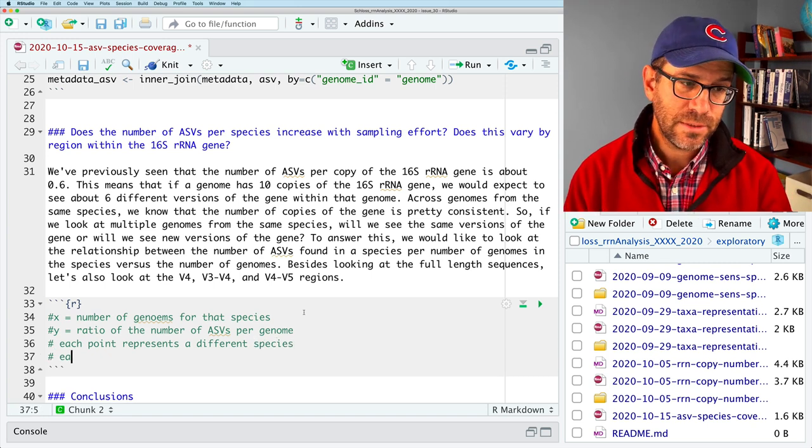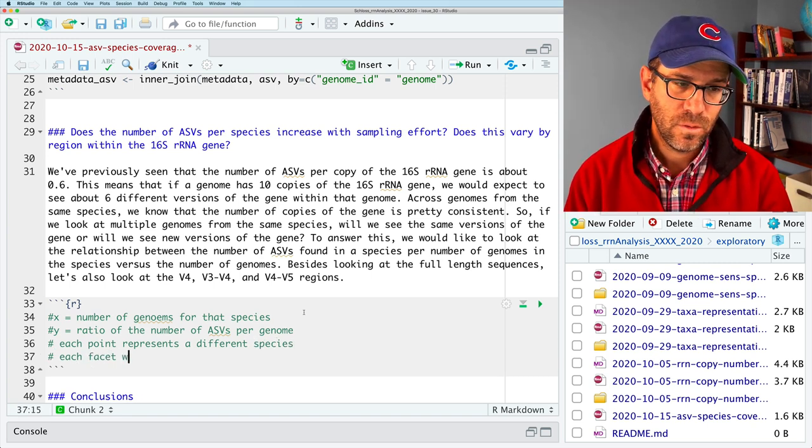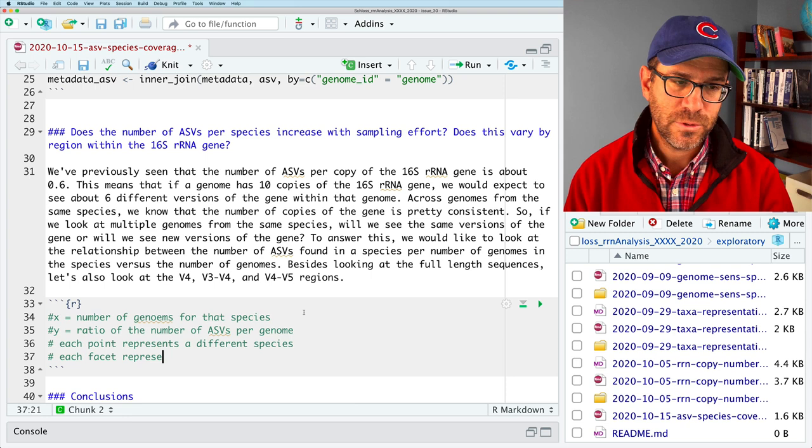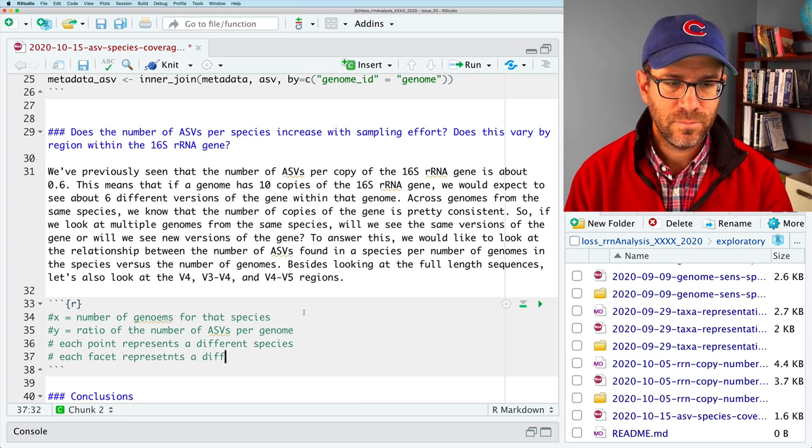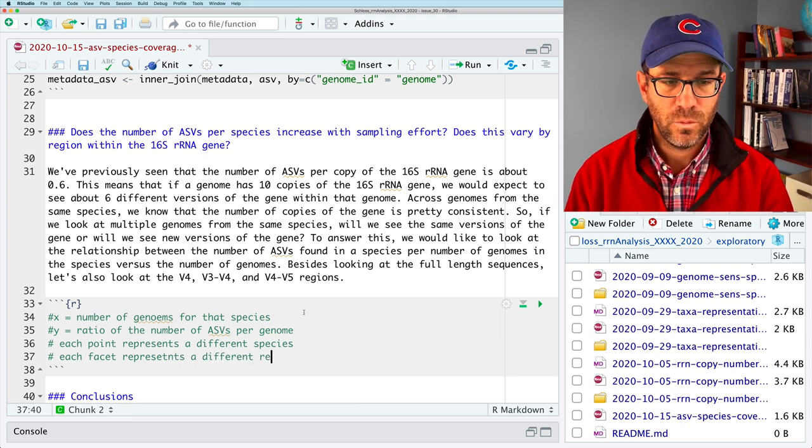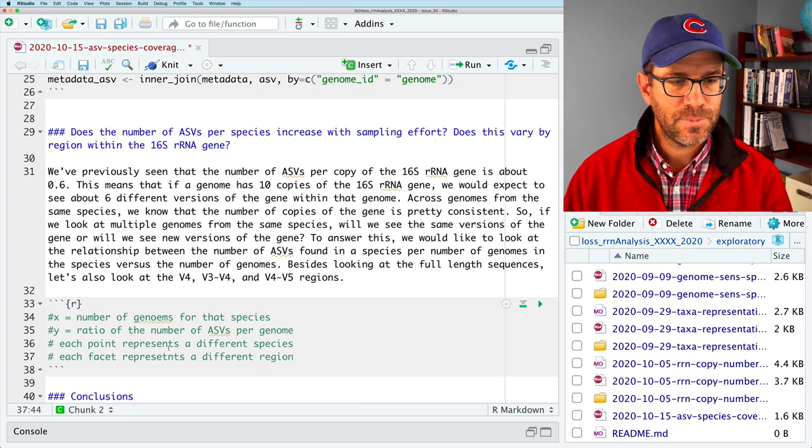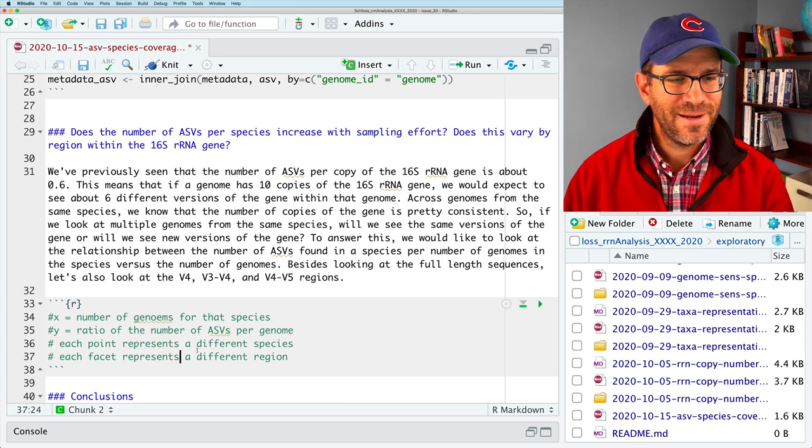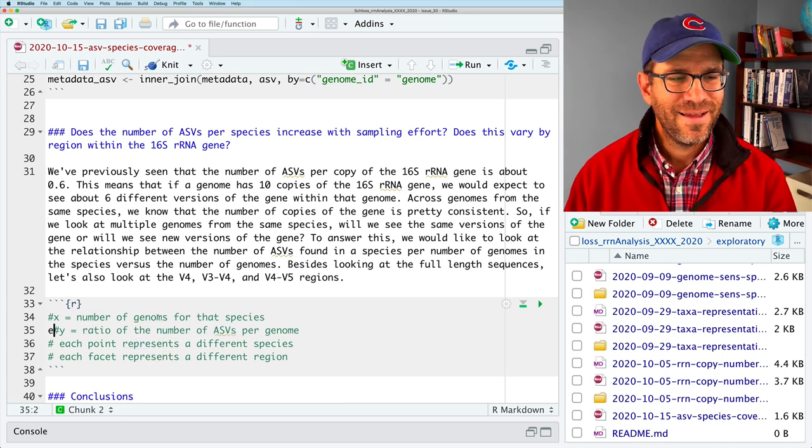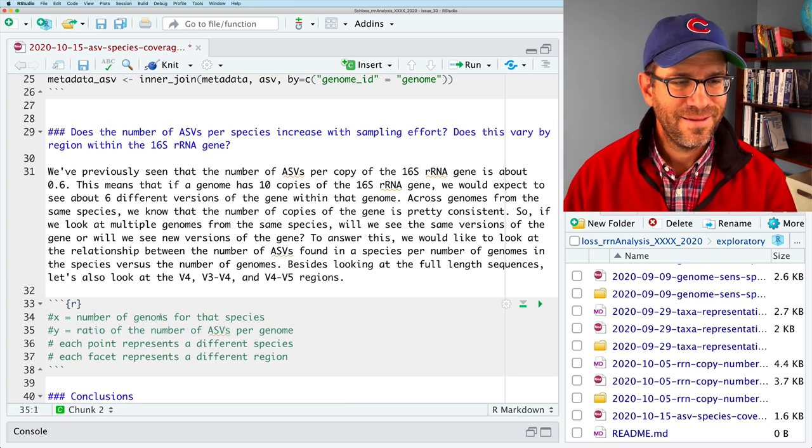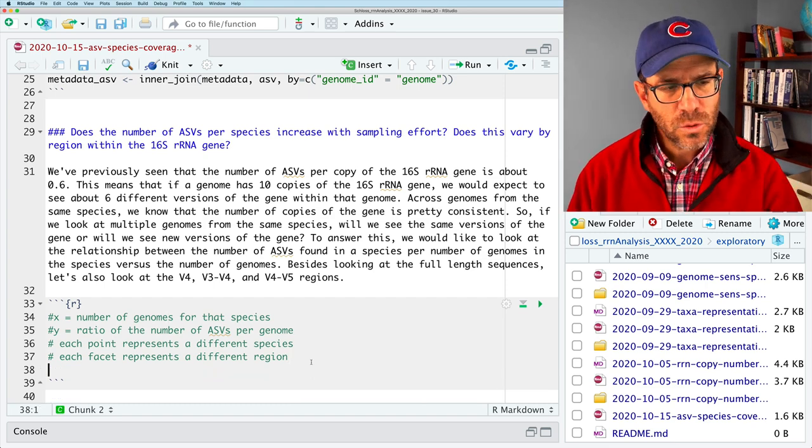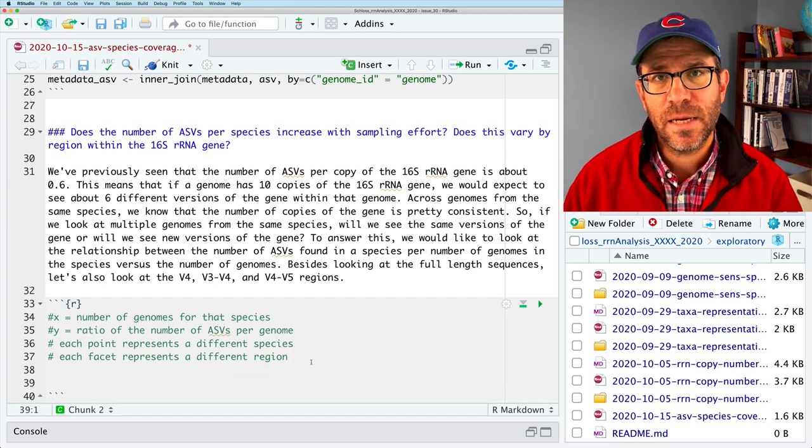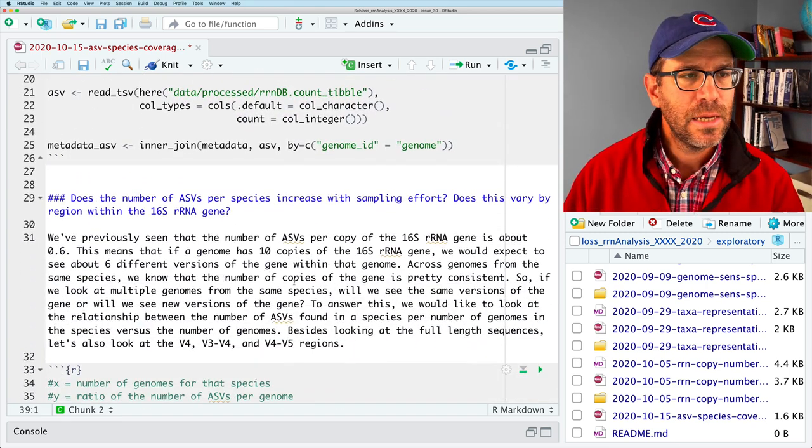Y, I'm going to make the, it's going to be a ratio. So the ratio of the number of ASVs per genome. So we would expect the number of ASVs per genome to fall off as we increase our sampling of genomes.